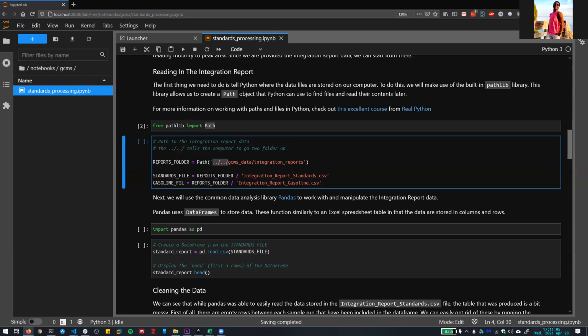I just downloaded it a couple minutes ago, and when I opened it, it gave me a blank notebook. You probably opened Jupyter Lab and it opened an automatic notebook. You need to navigate to wherever you extracted the contents of your folder, and it should be in the GCMS or the notebooks/GCMS folder. It's an already created notebook.